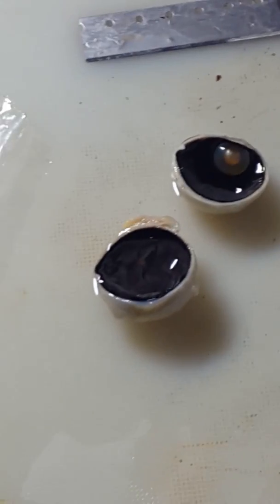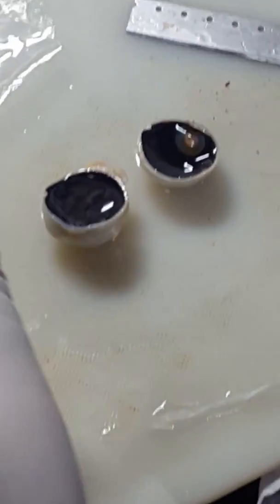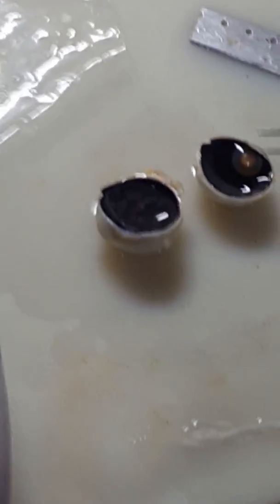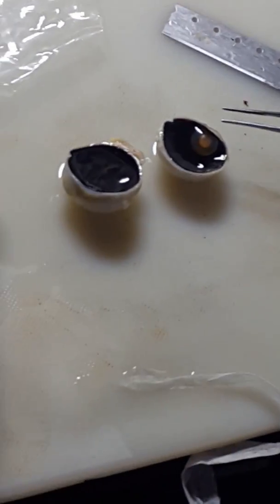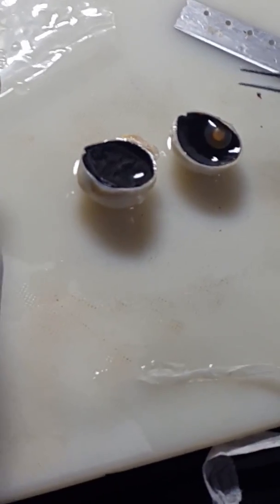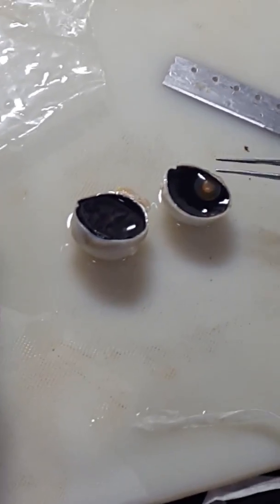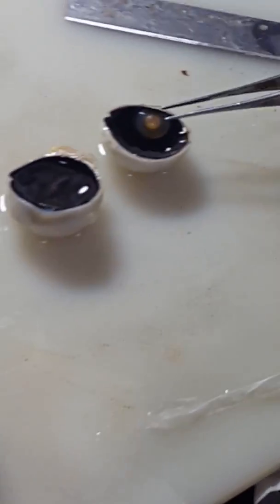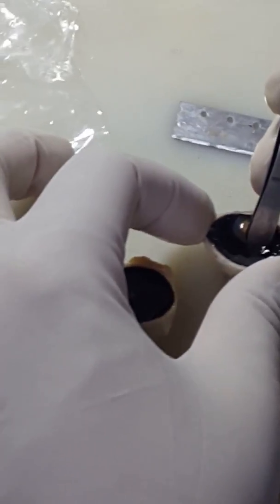The cornea is clear. The lens is present. We will section — the cornea is clear. The lens shows nucleus sclerosis. Can you see the nucleus sclerosis? The patient was 68 years old with lung cancer. The vitreous cavity is clear and the retina is attached.